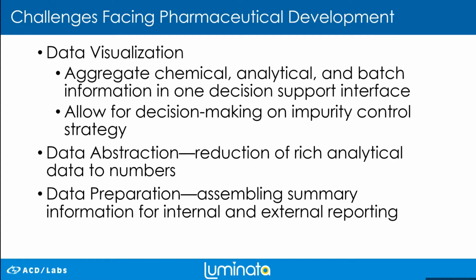And this becomes quite useful when you start looking at data preparation. Because from data preparation, that's where we're seeing the extent of using Excel, as you start looking at upper control limits, going through the control charts to see if any degradations or impurities are viewed at a higher level at specific projects, processes, or campaigns. So those were challenges that we saw.